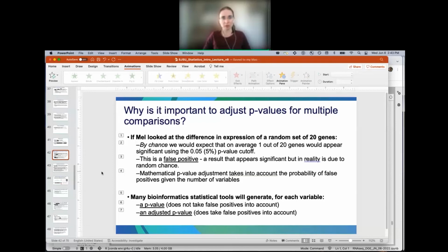So the best that I can generally do is to use accepted best practices, like Bonferroni multiple testing correction, and say, I know what I am seeing will be true positives. I may have lost some true positives, but at least I know I'm not looking at false positives. There are situations where you can set up an experiment where you know what ground truth is, and so you can calibrate for that, but you have to set up your experiment in advance that way.